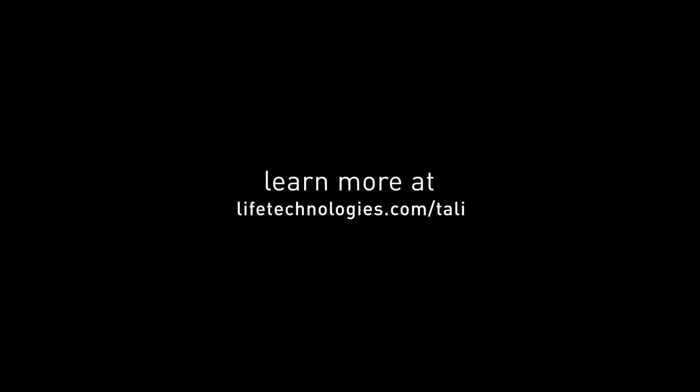For more information on the TALI image-based cytometer, visit lifetechnologies.com/TALI.